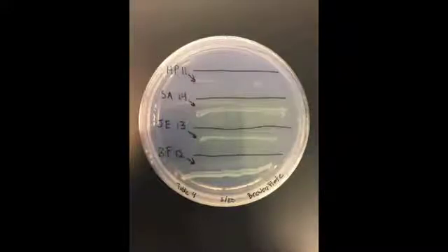Here is a sample of a Brewer's plate that has been inoculated with four different unknown microorganisms. You can see that organism HP11 at the top did not grow well in the anaerobic jar and suggests that this is an obligate aerobe, while the three other unknown microorganisms grew well under the same conditions, which can mean they are obligate anaerobes, facultative anaerobes, or aerotolerant anaerobes.